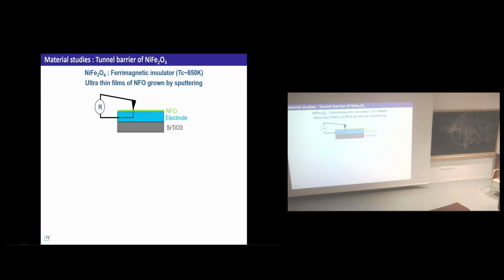Yes, it is necessary. You can afford it. When you do measurements, you test by scratching the surface and see if you measure the same thing. What I meant is you have to do it, but in fact you don't have to scratch. You have to apply high enough force. In some cases, for some materials, the kind of force you want to apply will be a problem, but for oxides, most of the time it's okay. That's what I meant. Yes, it's kind of cooking. It's not real physics.